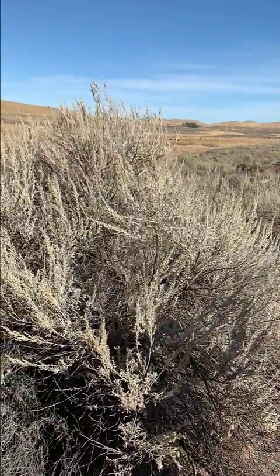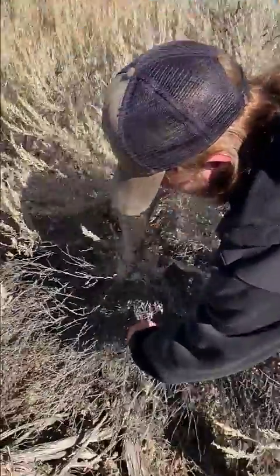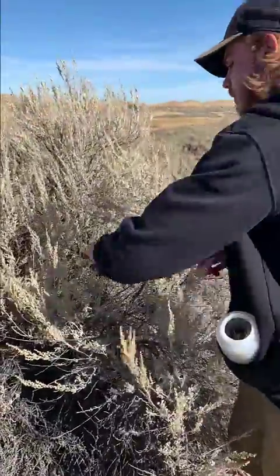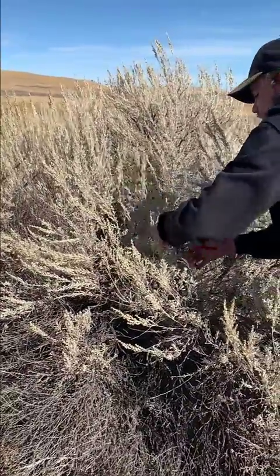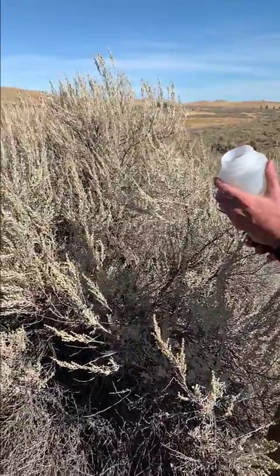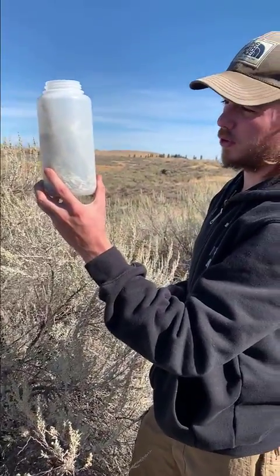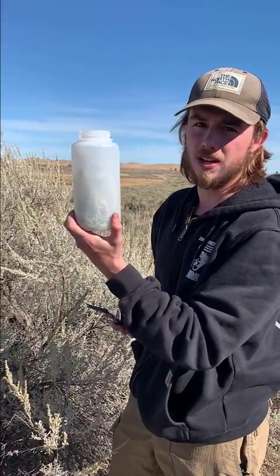Some things that we want to focus on when we are taking the sample is that we avoid the dead twiggy stuff, dead leaves, things like that, that can throw off the sample. We also want to make sure that we're getting samples all the way around the plant — from the top, the bottom, and the sides. We want to make sure that we get the sample vessel about three quarters of the way full, so we have plenty of sage to sample when we take it back to the office.